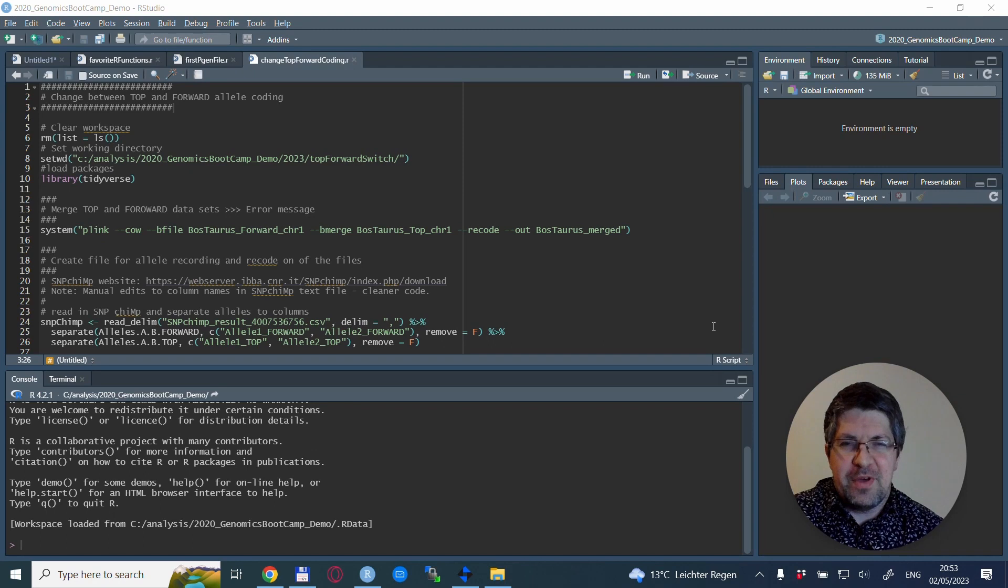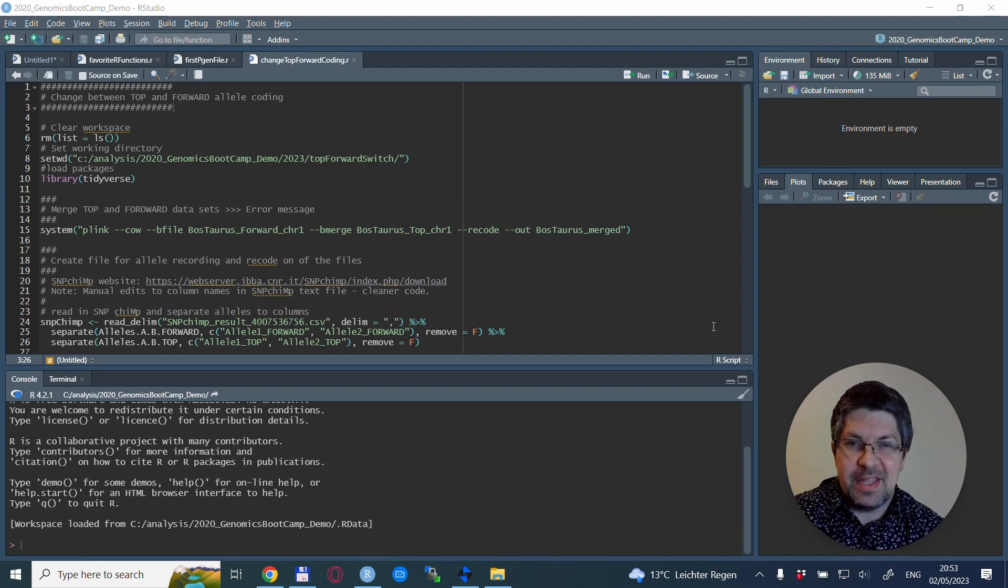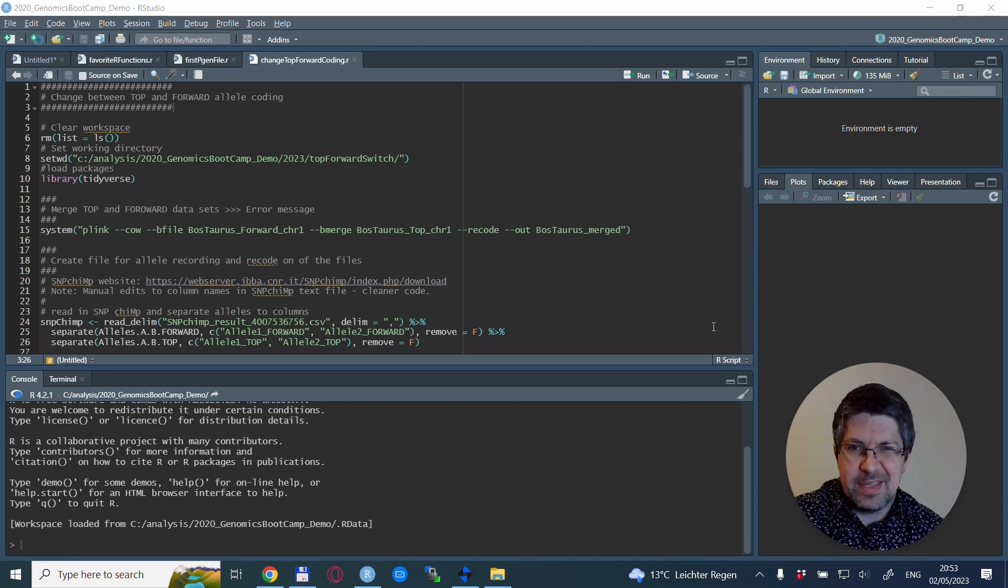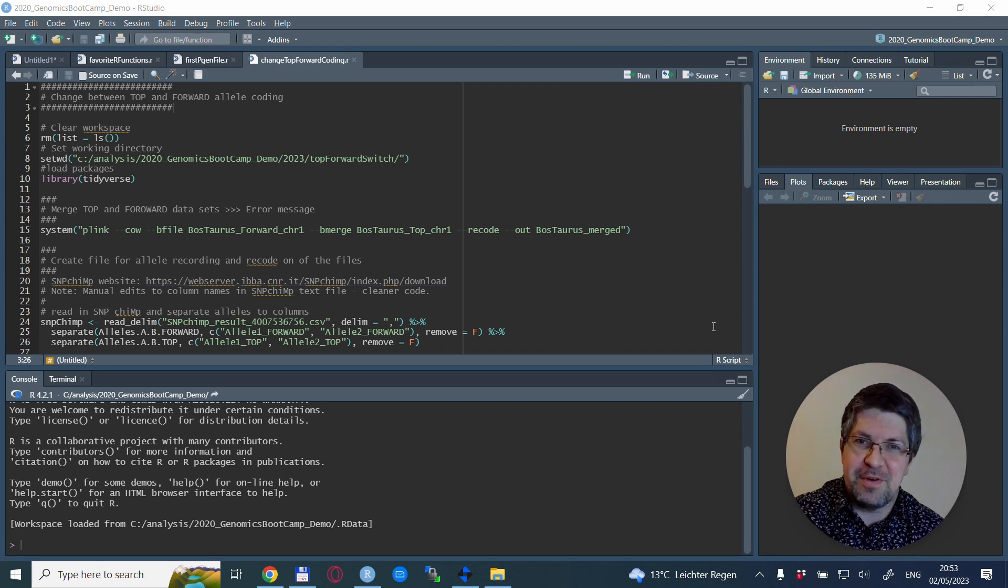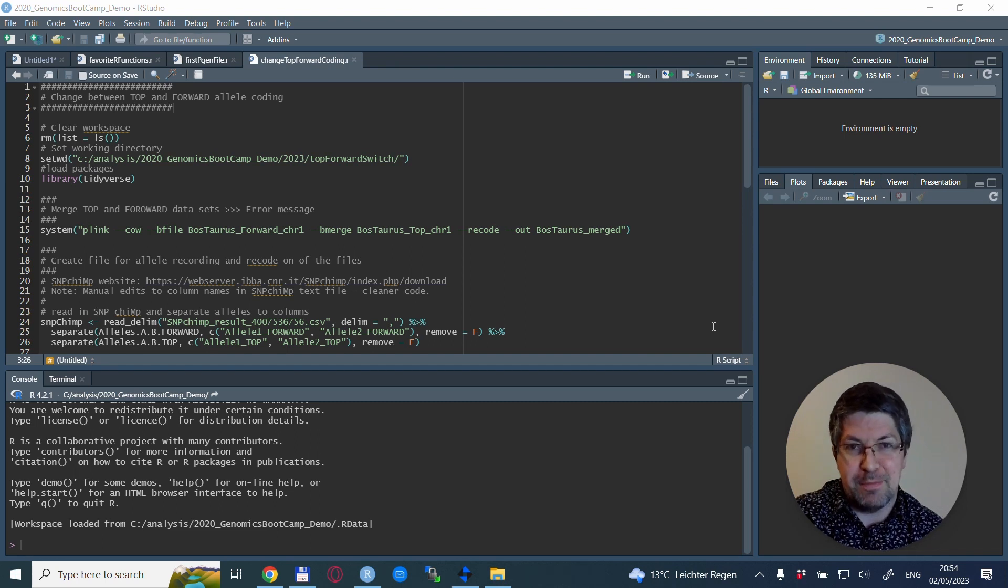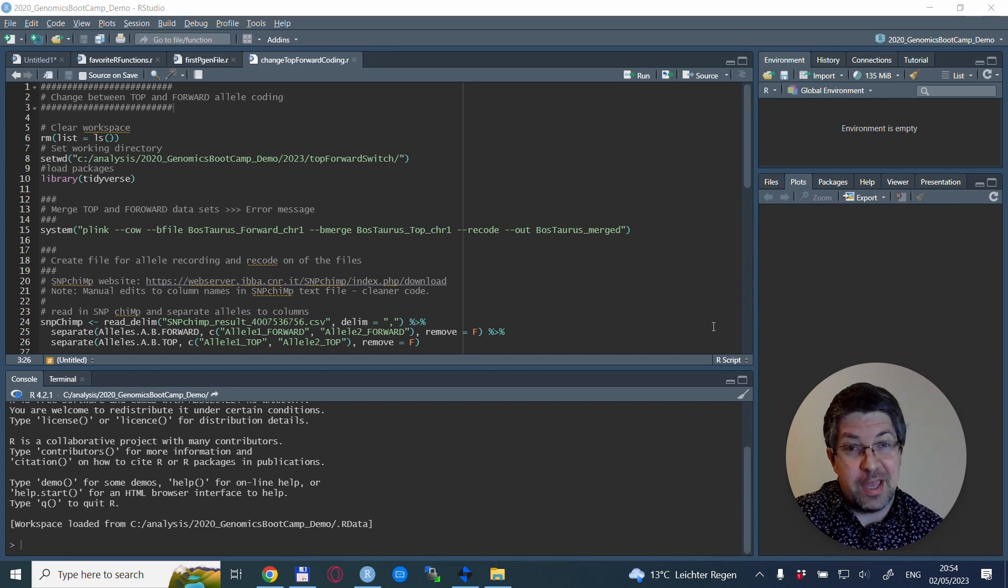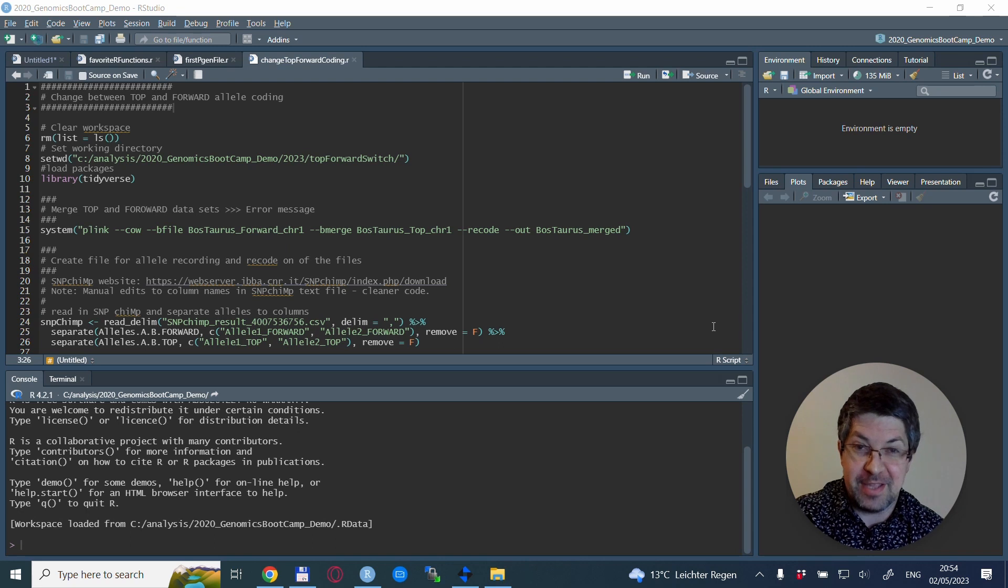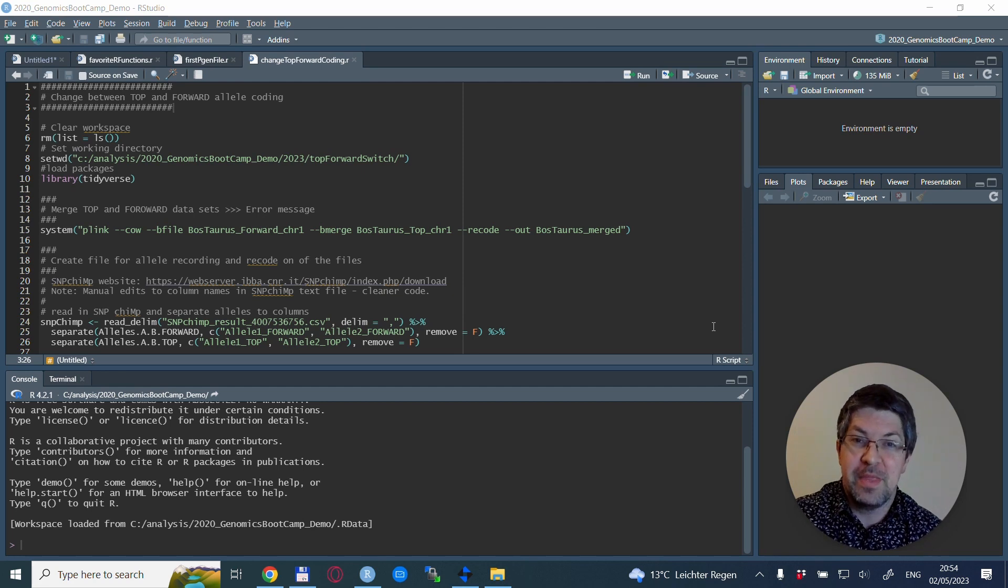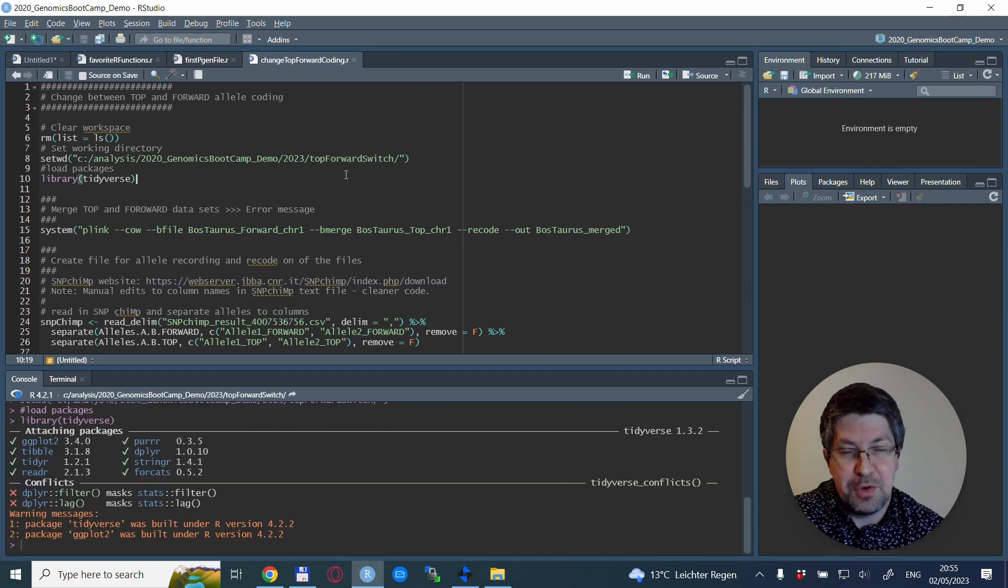First, I will show which error message it produces and then how to solve this problem. I'm providing you with the script and test data that I'm using in this example. I searched in my archives and I'm sharing with you data in an anonymized form, just the first chromosome, but it's enough to show the problem and the solution.